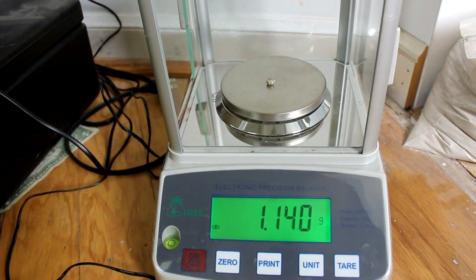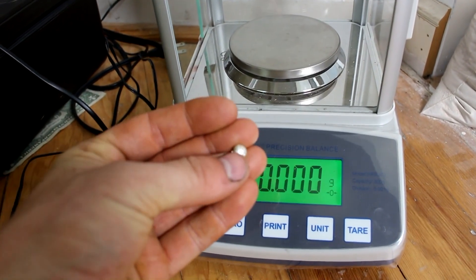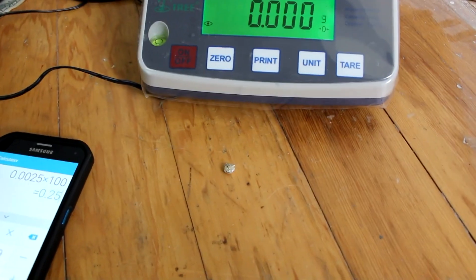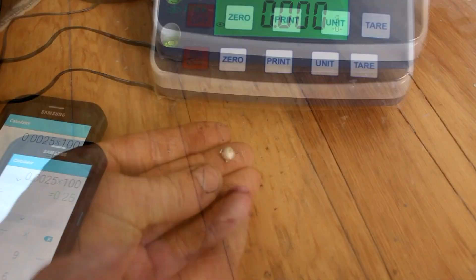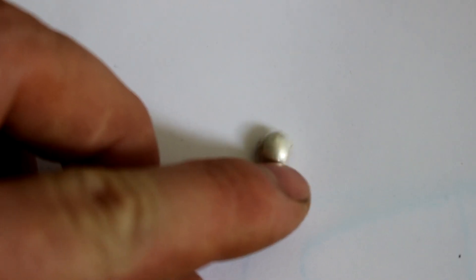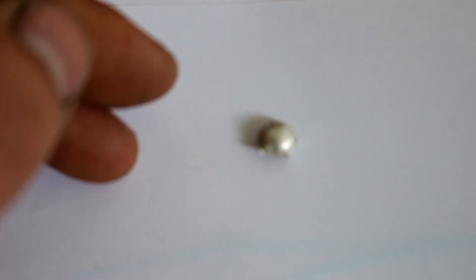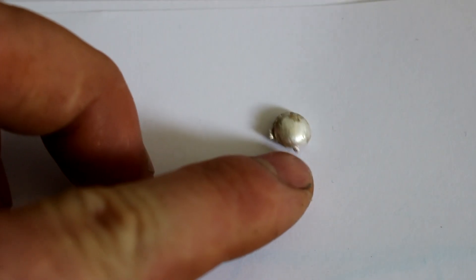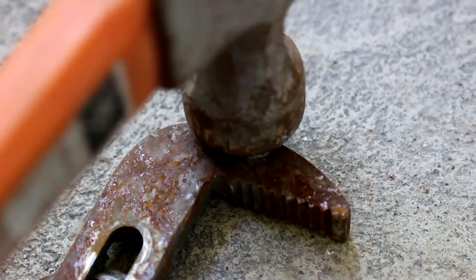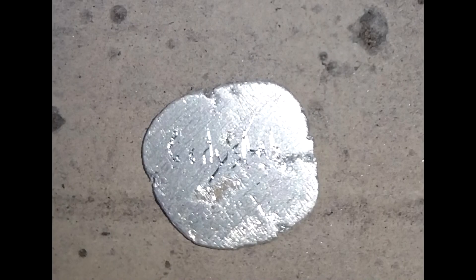Perhaps the Wikipedia number was a bit off. Maybe it could be the brand, or maybe they just add a little bit extra in. But anyway, I've got roughly four times the silver that I was expecting. I don't think it's actually the lead I added giving it the extra weight, because after cupeling, the lead content should be reduced down to less than a couple of percent. So there's definitely more silver than I was expecting. At any rate, I'm going to flatten this out and see if I can make a coin out of it. It's not my best coin, but I've scratched 'AG 5000 Pops' on the front and 'Cody's Lab' on the back.